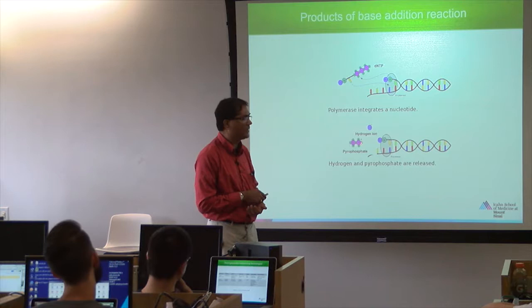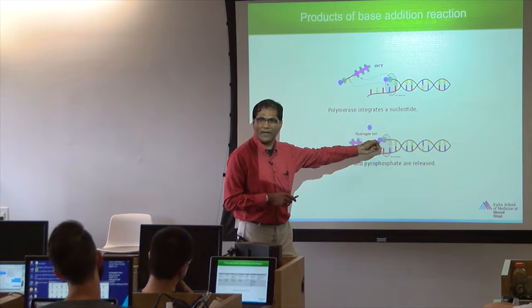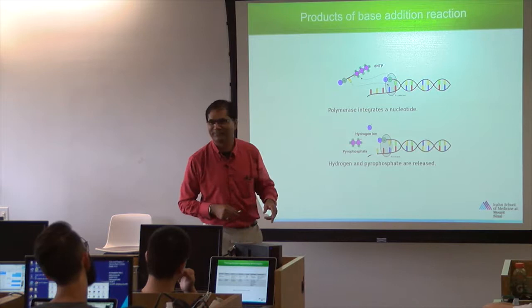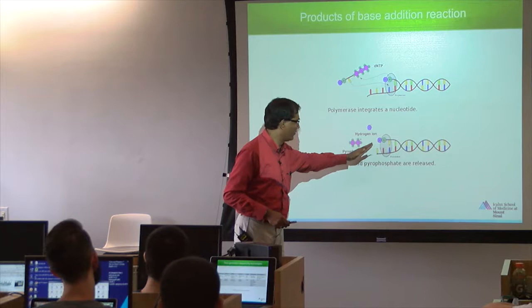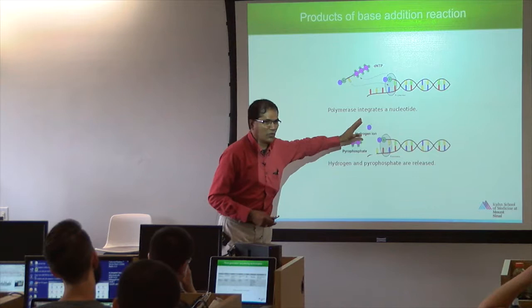So what is the advantage? When it is added here, during the reaction it takes a millisecond. After a millisecond, when the reaction happens, it breaks and chops off. It is released from here, goes into the solution. So you are adding the fluorescence and removing it during the reaction. Agreed? Great concept, right? Label it here, add it, remove it. It is fast, detect in that time. When it adds, immediately detect, it is released, gone. Next comes. When it is added, detect it, it is released, gone. It gets diffused into the solution, and you see the diffused fluorescence in the solution.